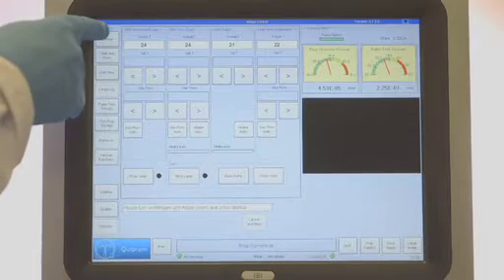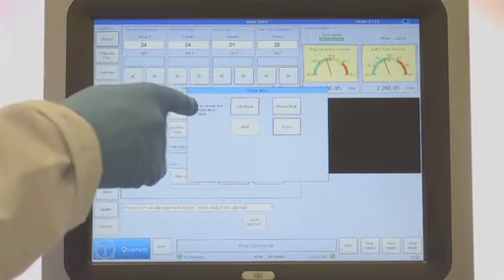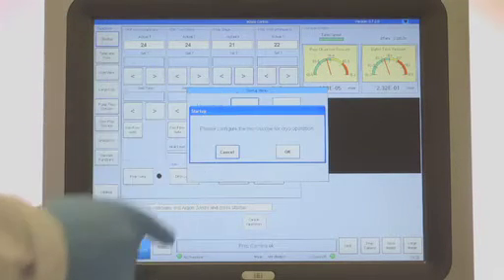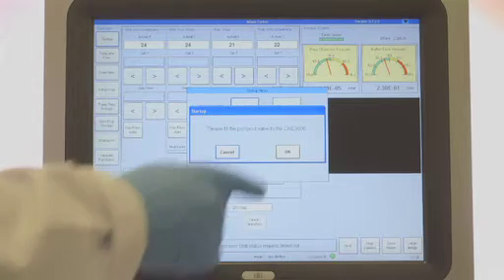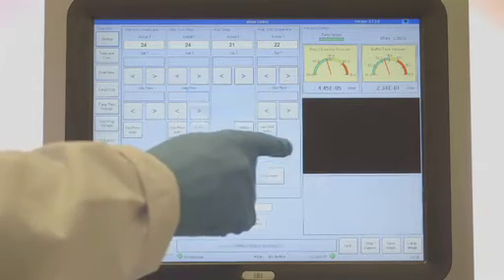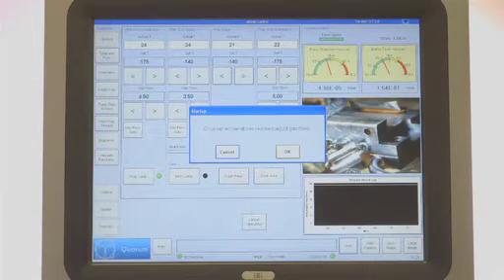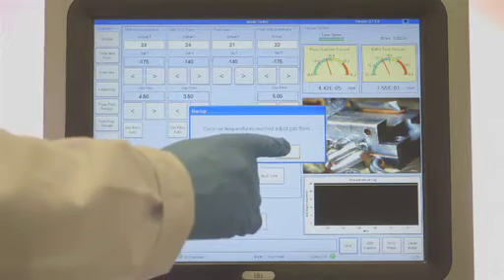Setting up and starting the Quorum 3010 couldn't be easier. By selecting Automatic mode, the operator is guided step-by-step through a sequence, with processes such as vacuum pumping and gas flow being initiated automatically.